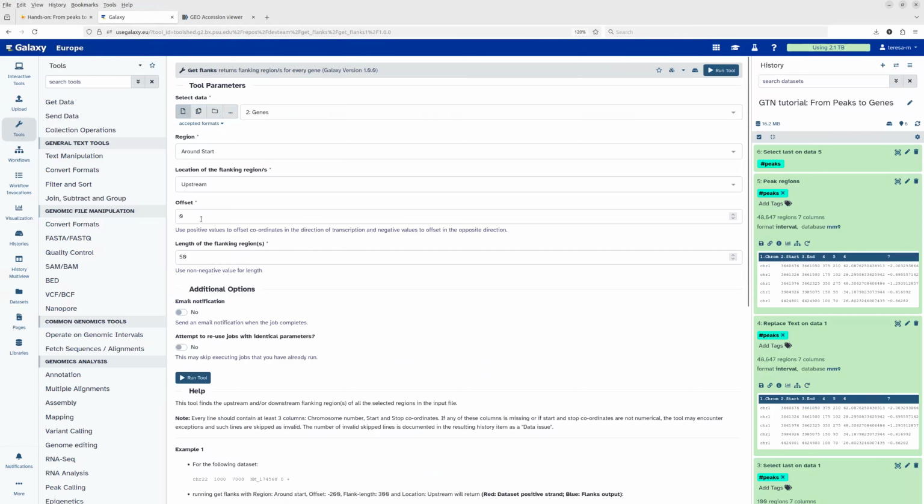So we specified the offset with 10,000 and then the full length of the flanking region with 12,000 because we are adding 2,000 nucleotides upstream of the gene, because in this 2,000 area region there should be somewhere the promoter region located.